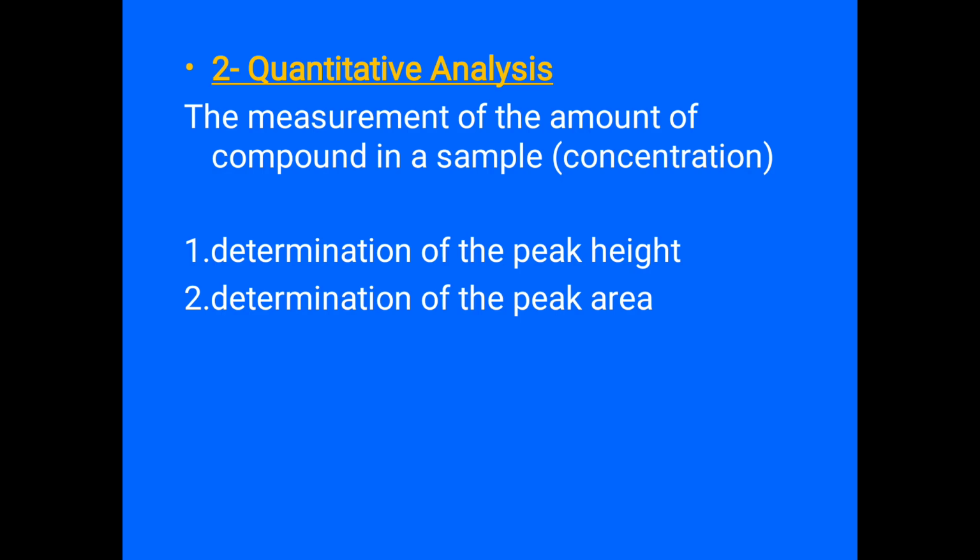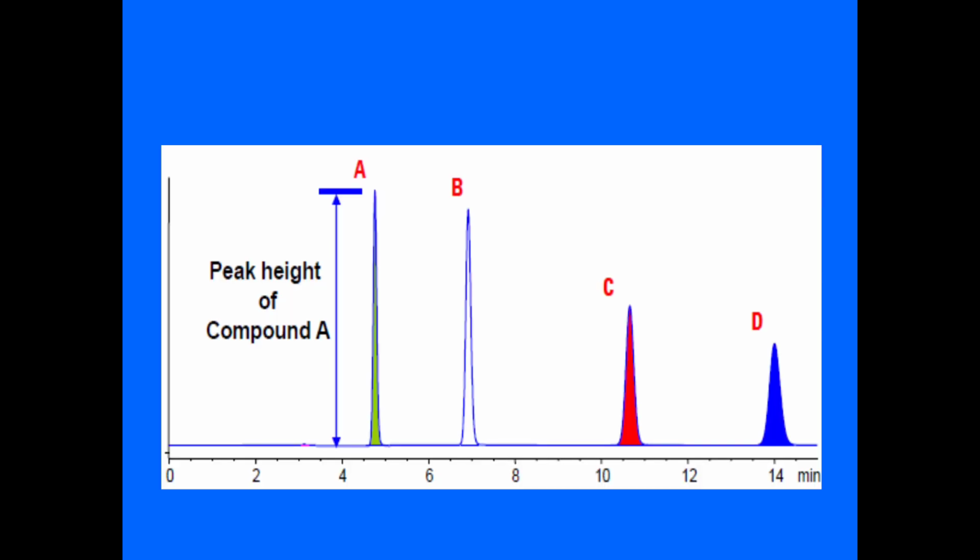Quantitative analysis, the measurement of the amount of compound in the sample, concentration, determination of the peak height, determination of the peak areas. Peak height of compound A.